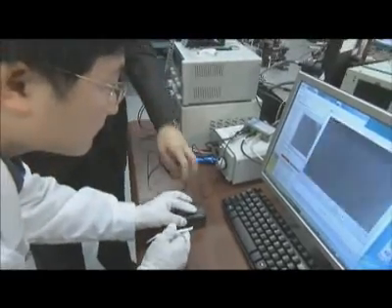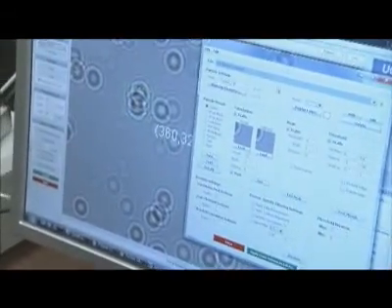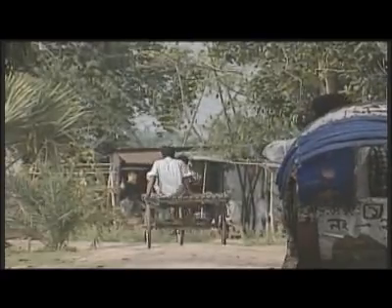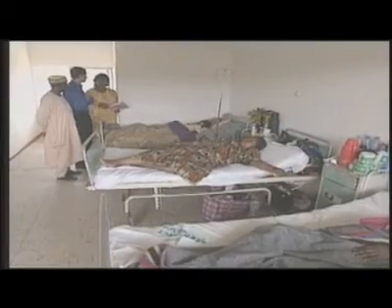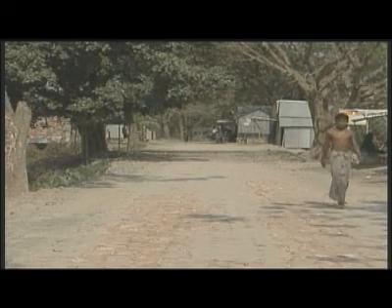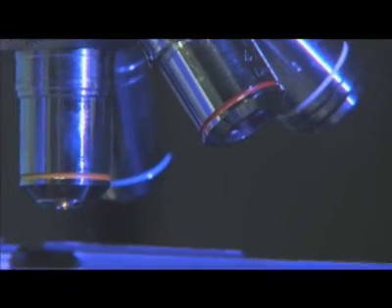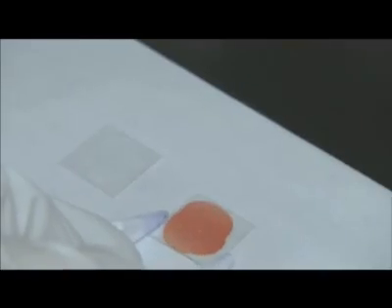Ozcan's invention is poised to radically change the way diseases are detected and monitored. "There are parts of the world, unfortunately, that don't have these resources. There's no laboratory, there's no infrastructure to send it and get the results back. So there's nothing out there to provide you some basic tests regarding the patient's health." In developing countries, microscopes and the advanced labs needed to analyze what they see are often just too expensive.